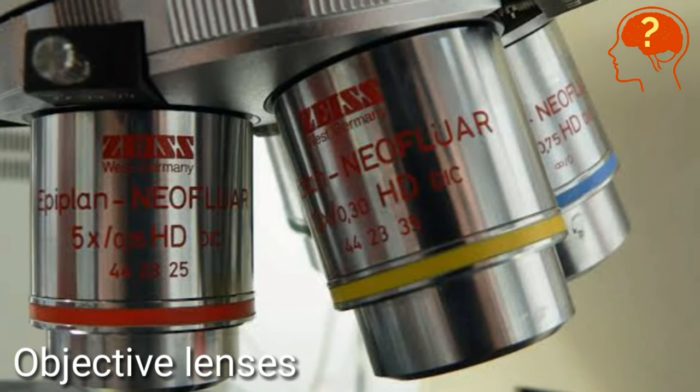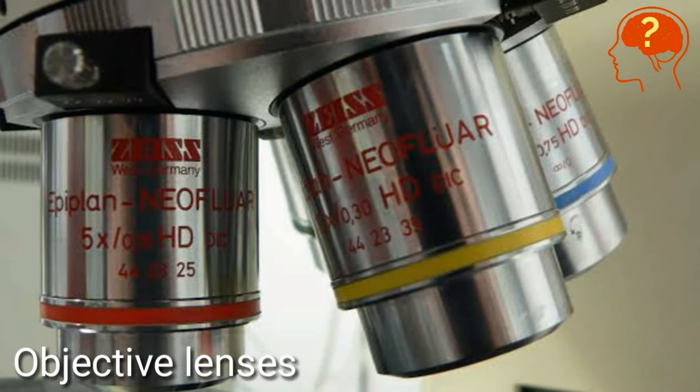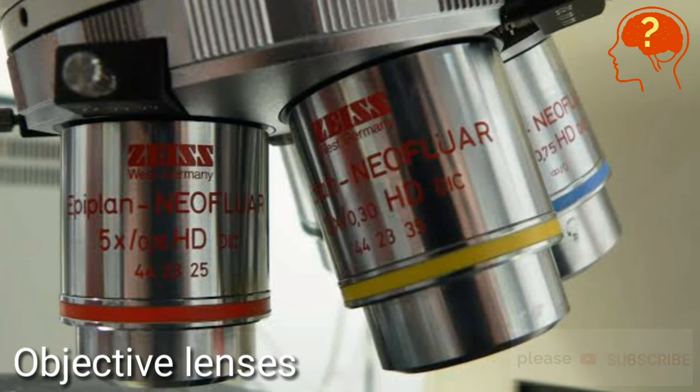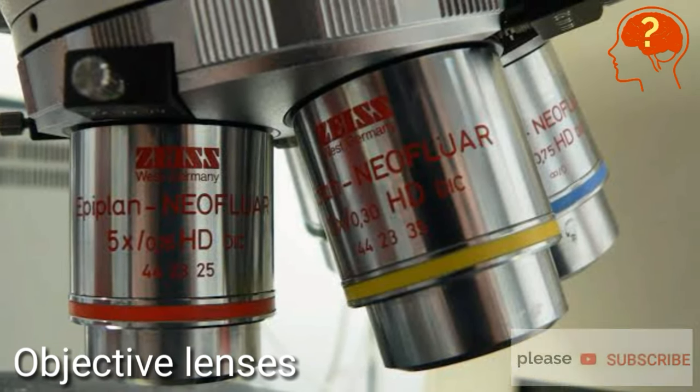You should start with 5x, then 10x, and then move towards 40x, the larger one. You can rotate the nose piece and adjust it.